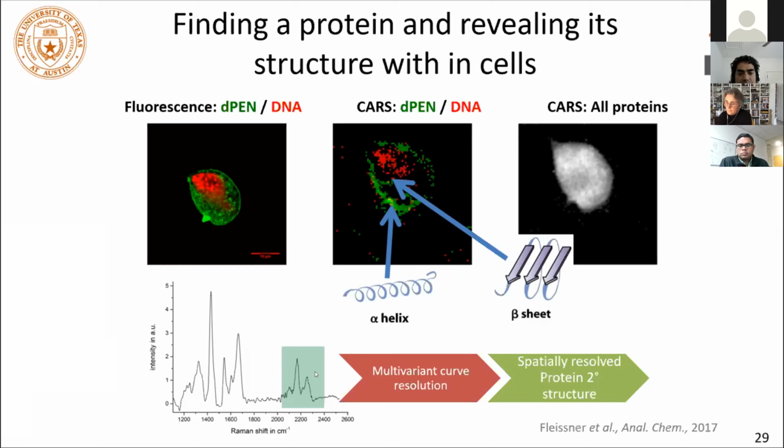Which is really toxic. But you're at 1064 or 1200, and that is substantially less toxic because the absorption cross-section of water there is much lower. So you're in the so-called water window. In our case we use 20 to 30 milliwatts of average power with a rep rate of 1 megahertz. So it's not small, but it's not toxic. Cells still divide. Yeah, super.